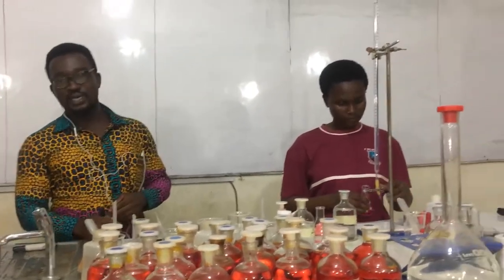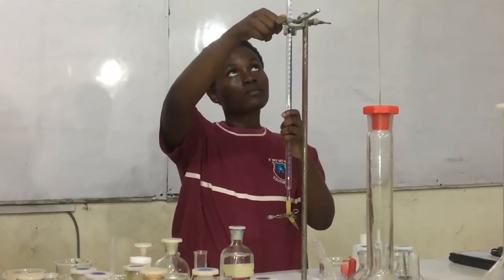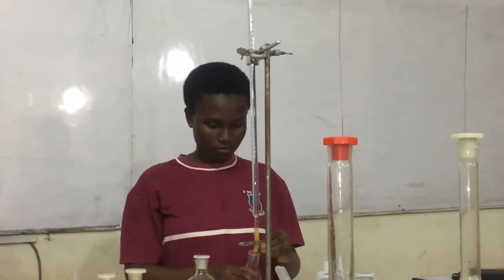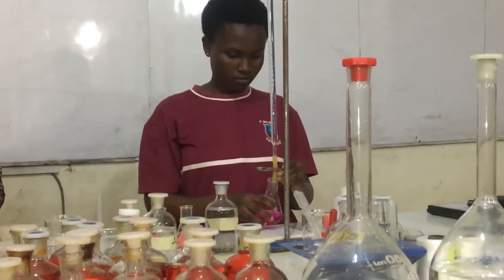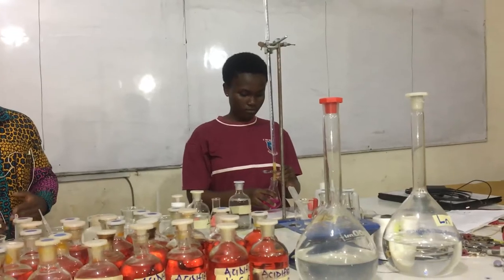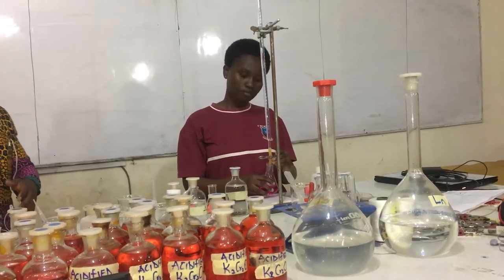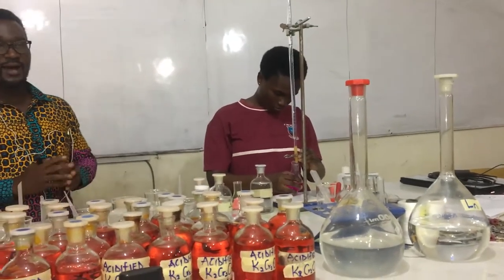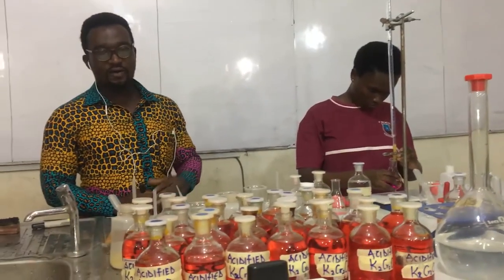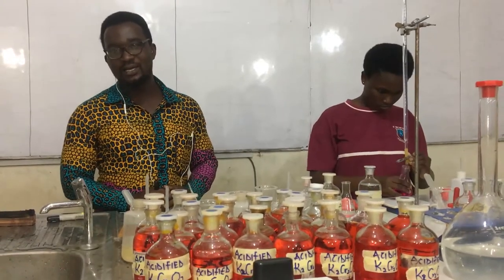So this time she's going to begin with the titration. If there is a need to do some adjustment as she's doing, do that adjustment so that you don't find yourself wanting. So this time she's adding drop by drop, bit by bit, to see where the color change will exactly occur. Remember, it is a weak acid against a strong base. We have already learned from the theory that at the end, the solution will be alkaline in nature.